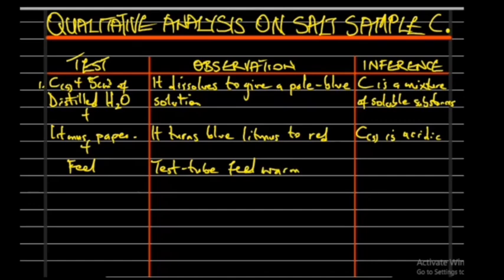That is because the solution is exothermic. Those are the things we observed when we added distilled water to this particular substance.